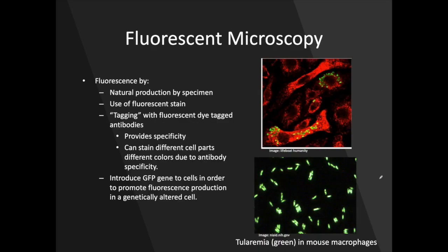Now comes my absolute favorite form of microscopy, and that is fluorescent microscopy. This stuff is super cool. In fluorescent microscopy, we can do this one of two different ways.